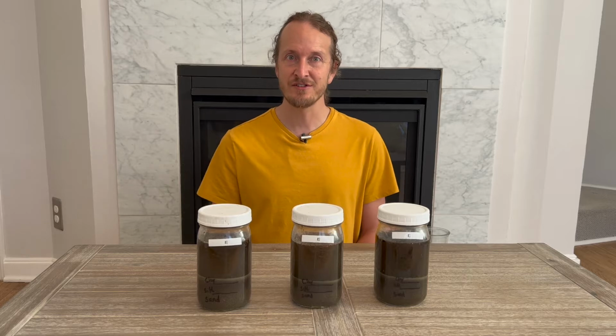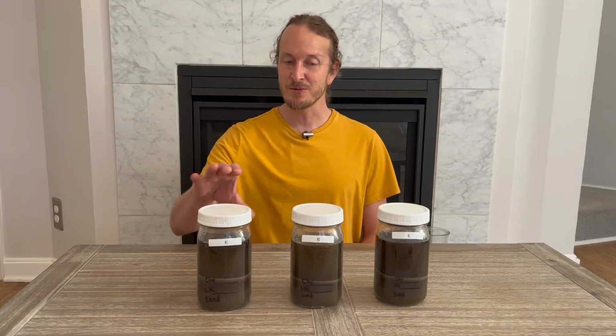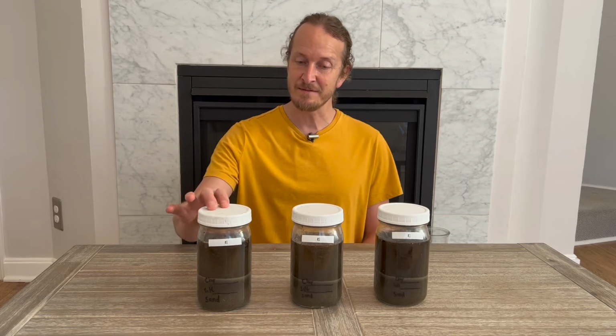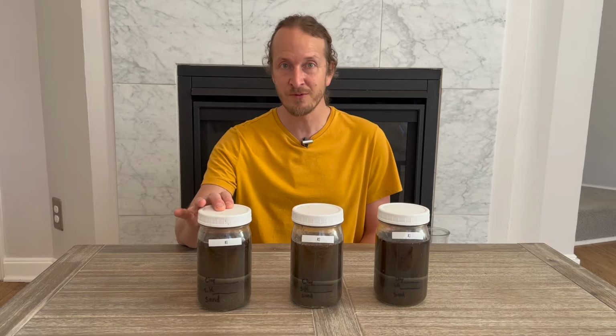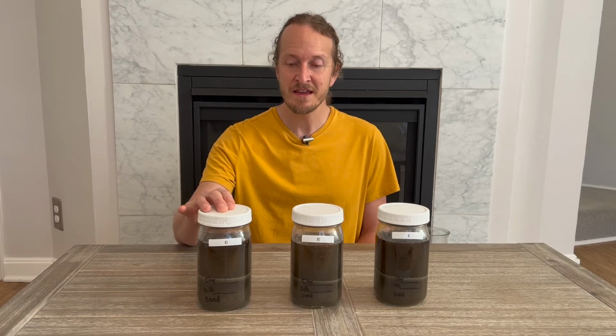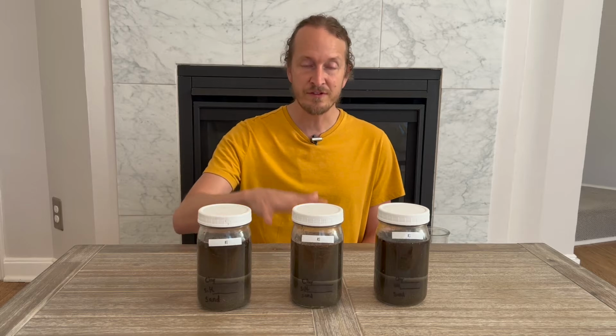We are back to see the results of the soil texture test that we took a little while ago. So we have the 3 different jars here from the 3 different soil samples that we took. And, you know, the jars sat for a couple of weeks. I just didn't get around to coming back to them. So the different layers are nice and settled now.